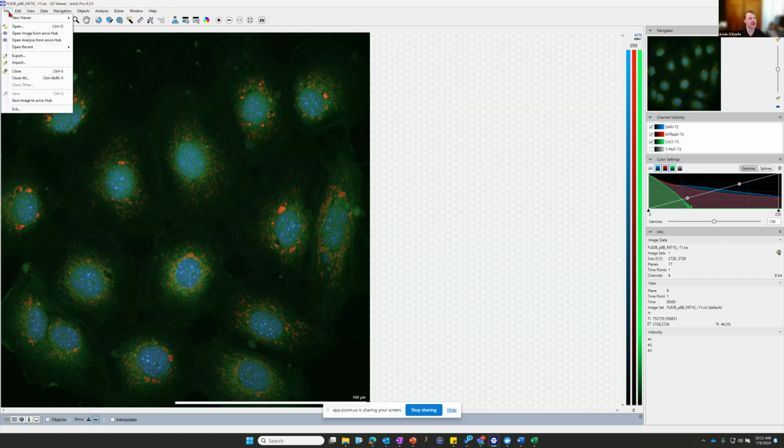There is another thing I want to mention with import. Let's say you want to analyze and run a single pipeline on an experimental data set you have. So let's say you have a control group, condition 1 and condition 2, and you want to compare them. One of the ways I would recommend is, I personally like to have all of my images saved in one single file. So if I have 6 in it for each of the 3 conditions, including control, I want to load all 18 images into this single file. It's just easy data storage and navigation for me.